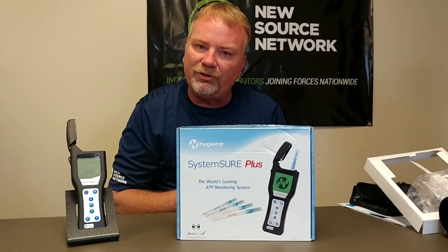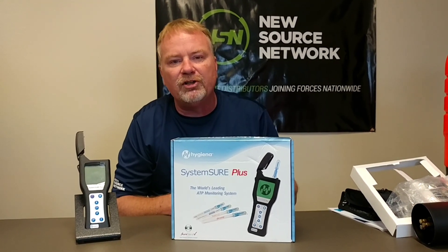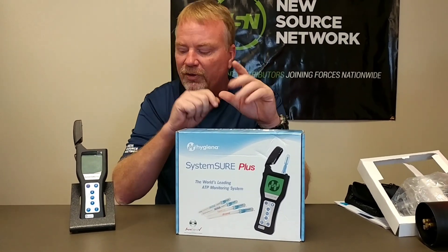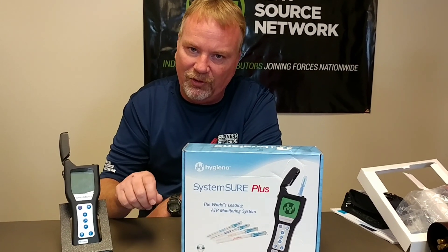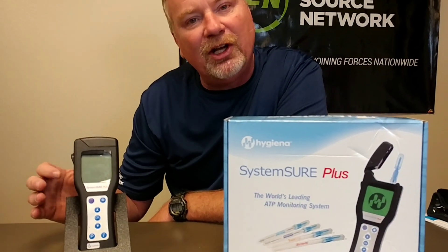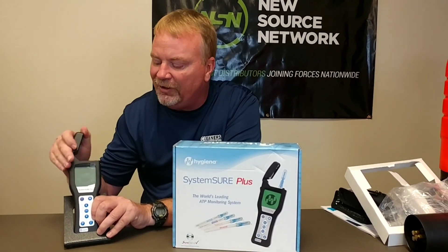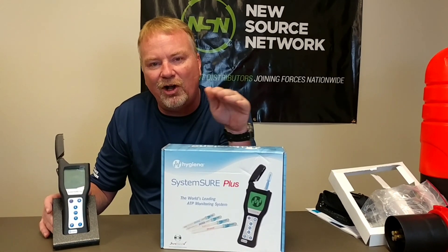Here's the thing — you've got guys going into schools, daycares, gyms, restaurants, spraying for COVID-19 and they don't know whether they've done a good job or whether they've taken the ATPs down to a level where COVID-19 cannot survive. This machine right here will absolutely prove that you've done your job properly. When you calibrate it, let's say you've got a daycare — you go in and pick four, five, or six spots. This thing comes with fancy Q-tips. You rub four or five different spots, put the swabs down in the meter, close it, and within about 15 seconds it gives you an ATP reading. Anything above 10 and you need to clean and disinfect. Go in, do all those areas, clean and disinfect. When you're done, let it dry, come back and do your test again. When you're below 10 on your ATP meter, you're safe to leave — it's all disinfected for COVID-19.